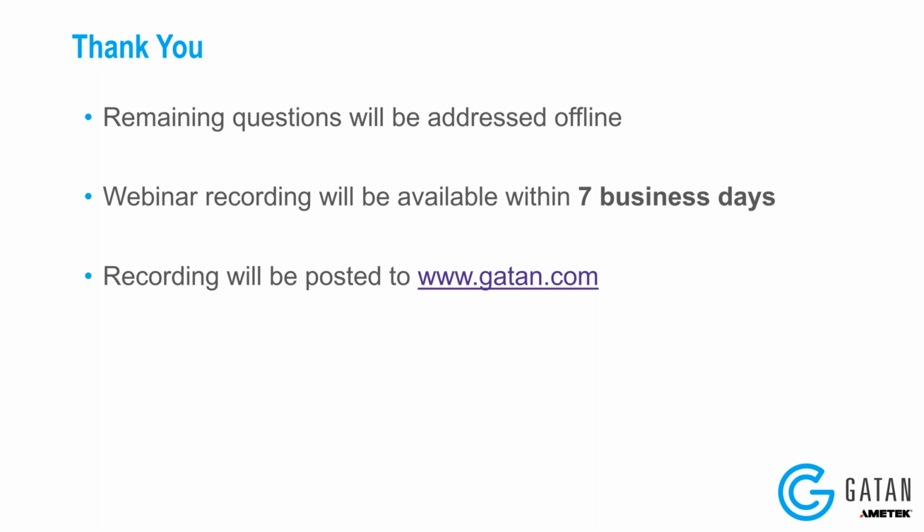Okay. And then another question that came in is can you compare and contrast the ClearView with the Stella, Alpine, Metro, and K3 cameras? Good question.